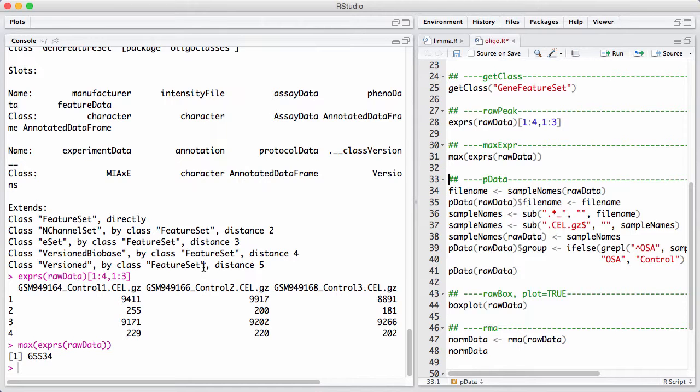This is not a very, or research has shown that this is not a very good scale to work on with microarray data. Usually, we want to log transform these data here. When we log transform them, if we use a log with base 2, we get a number basically between 0 and 16.